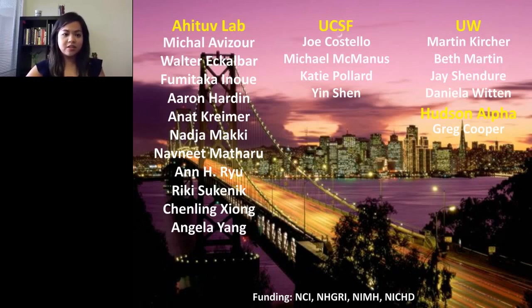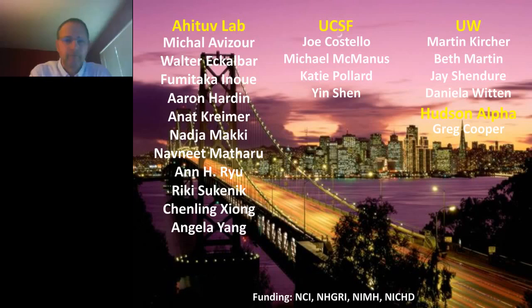Our first question is, do you get more than one mutation in your saturation mutagenesis experiments? Yes, the answer is yes. The way we've been doing these mutations now is through error-prone PCR. We take the regular wild-type sequence that we cloned, and we PCR it with a Taq polymerase that is prone to make mutations. And so we get a lot of different mutations in that sequence.